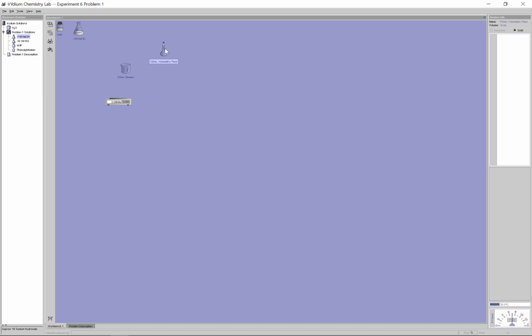So what I'm going to do here is take the solid, transfer it into the beaker here, and pre-dissolve it. I just want to make sure it's something less than 100. I'm going to transfer these volumes into the volumetric flask. I might need to wash out the beaker a couple times just to make sure all the solid is actually tossed in here, and then eventually add water in the volumetric.